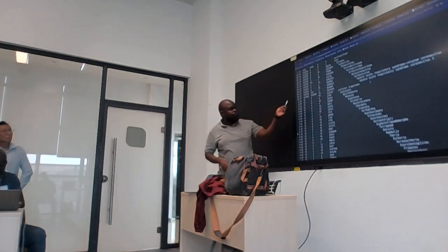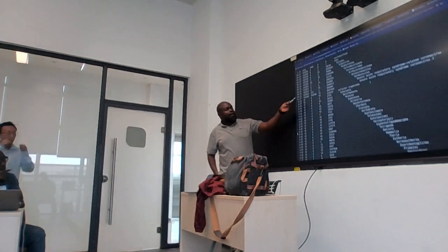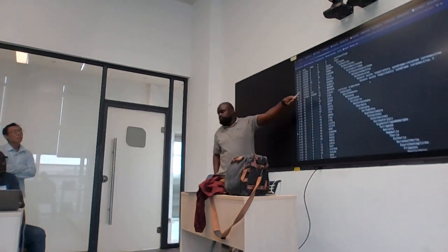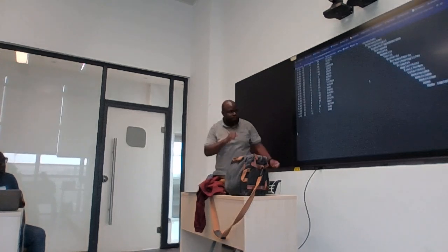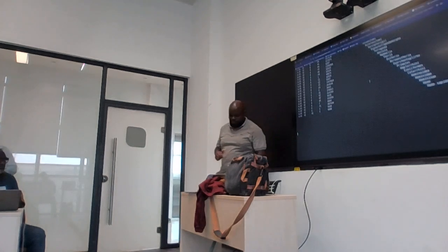So here, it's telling us for this sample that 97.97% of our reads are SARS-CoV-2, okay? Which is good. And down here, we can see that 0.05% are human. So this is good. This is what we expect.